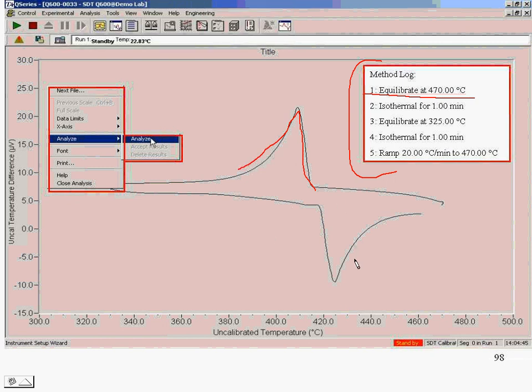This is our melt. Now we do it the first time because when you put, whether it be a powder or some zinc, a piece of zinc or whatever, you want it to melt at once so it flows and gets a little better contact with the bottom of the pan. And that's why we're doing this.